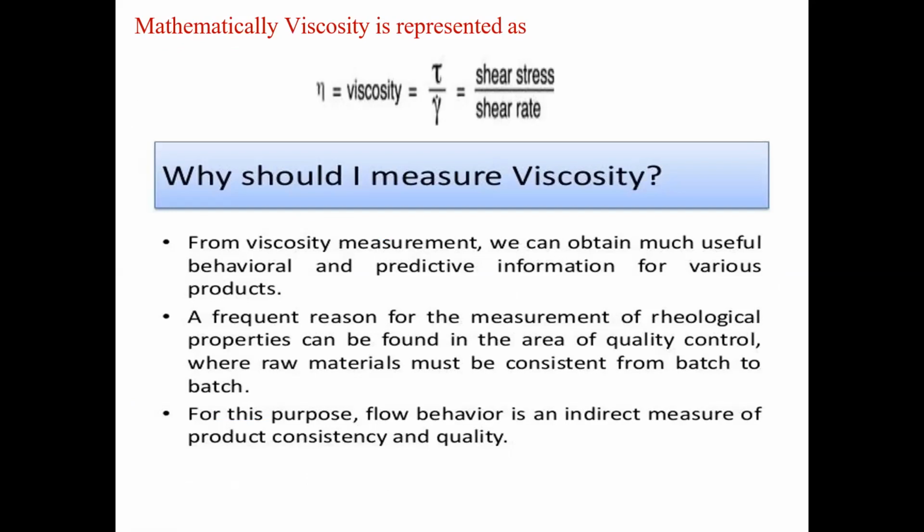So why should we measure viscosity? From viscosity measurement, we can obtain much useful behavioral and predictive information for various products.